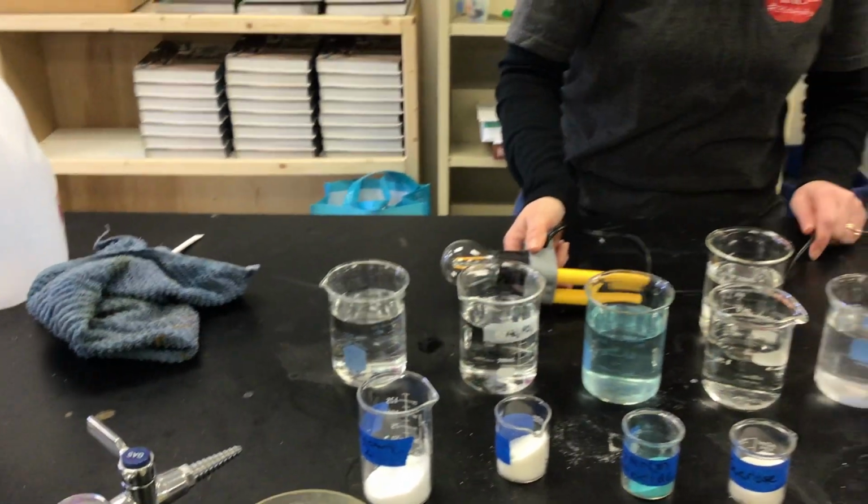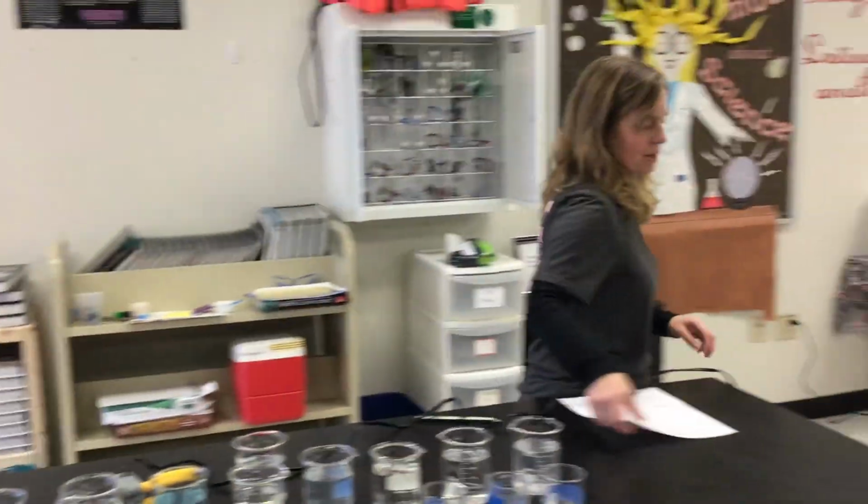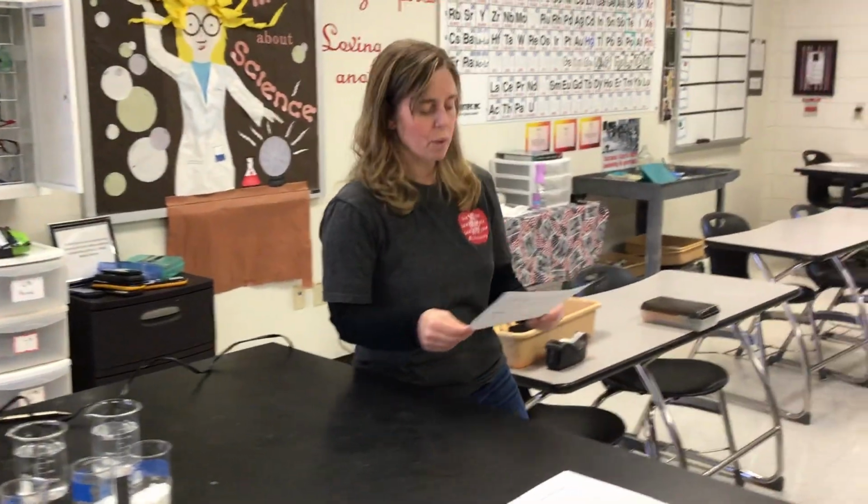Okay? Now, the last part of this lab is you have post-lab questions in which you're going to identify some of the answers to those questions, and then there's a back part where you're going to classify compounds as ionic or molecular based on its properties, melting point, solubility, and conductivity. And then you have to write a summary of what you learned in this lab for your conclusion statement.